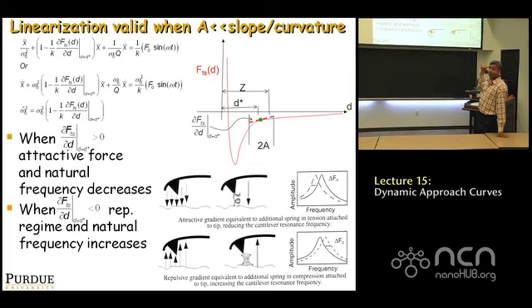But the gradient here is positive, and remember, positive gradient corresponds to an attractive gradient. Now, what if that green dot were located on the left of the minimum? So somewhere to the left of the minimum. It would still have a negative force, but the gradient would be repulsive.